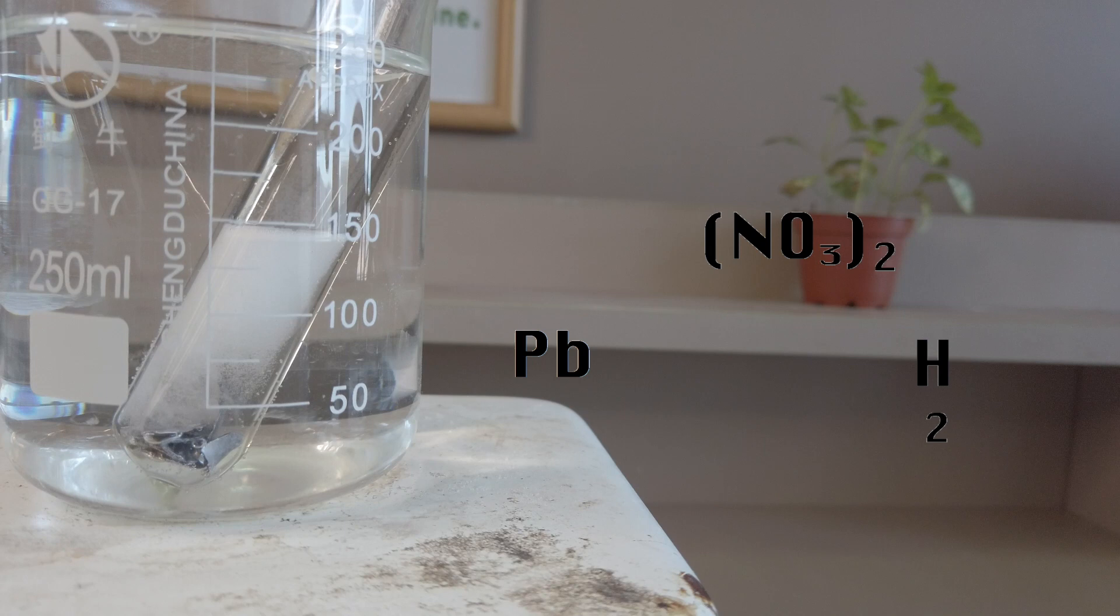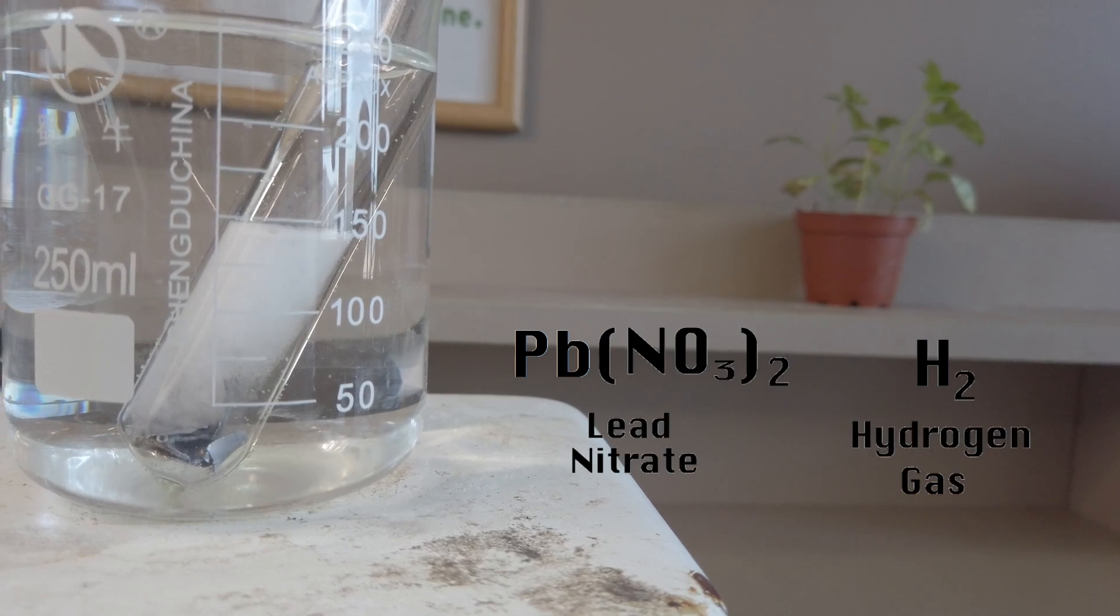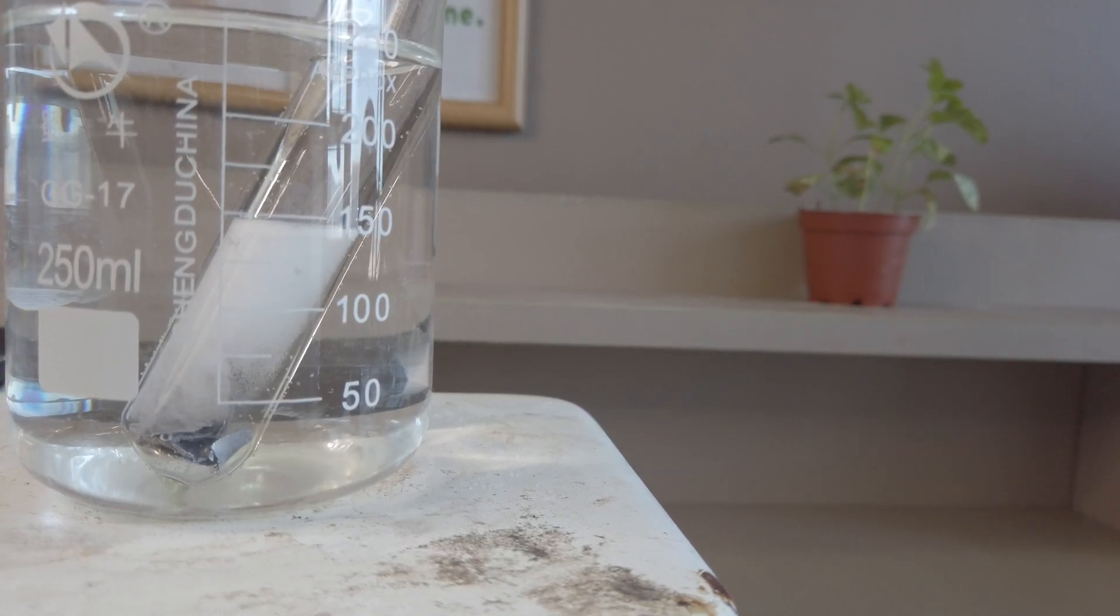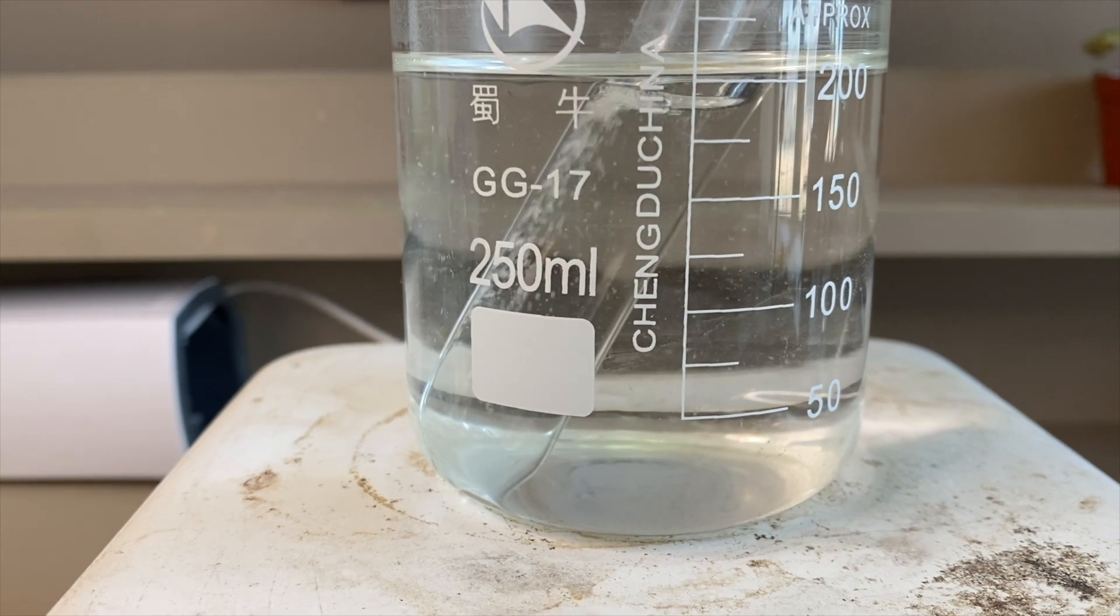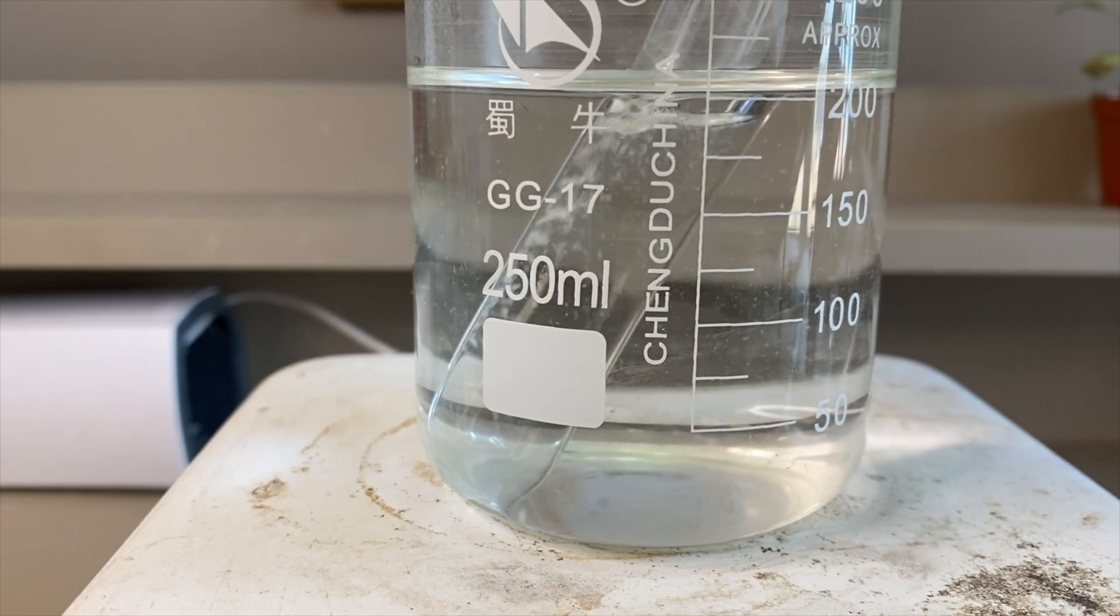The lead solid here reacts with the nitric acid to form lead nitrate, which is soluble and colorless. When the sheets are dissolved completely, more of it is added to the solution until the acid stops reacting.